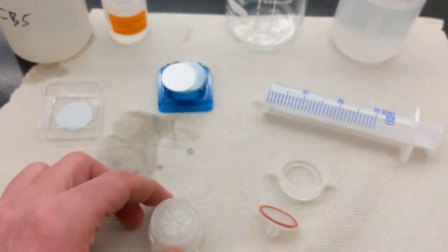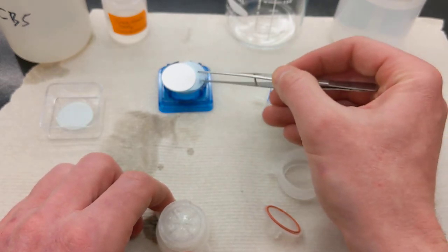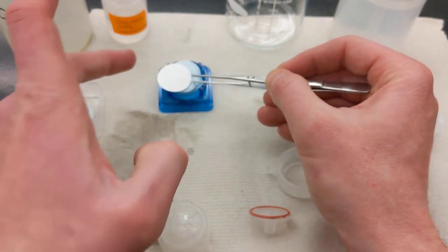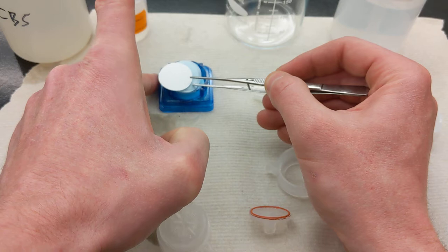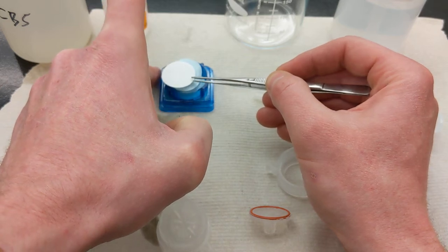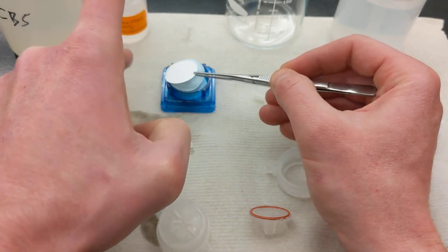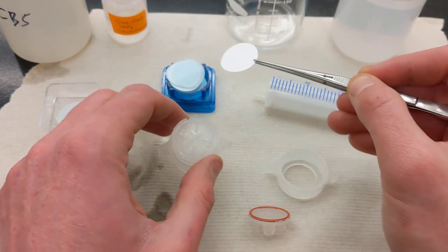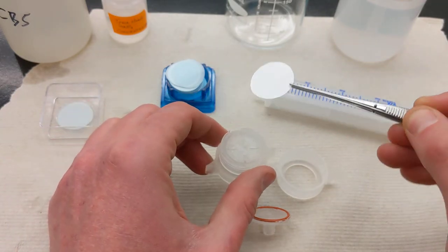So what we're going to do is use a pair of forceps, and you're going to grab a 0.45 micron filter. You can do this with gloves, or you can do this with your hands. Just be sure not to touch the filter with your fingers, or anything dirty for that matter.